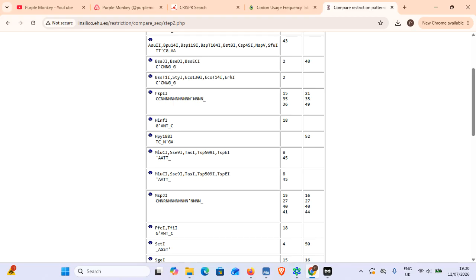And on the flip side, HPY188I, that old chestnut that doesn't so much trip off the tongue as fall, is introduced by the CRISPR wobbles. So this actually is something I have meant to bring up in a previous video. After all, it's one thing to eliminate a restriction site, but a nasty deletion or disfigurement could cause a loss of a restriction site and get your hopes up and cause the dreaded false positive.